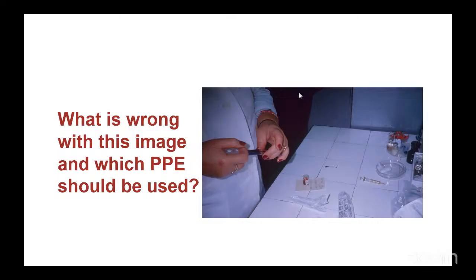Someone says no gloves. Use of hand gloves. Okay, is that all? Look at it very well. Can't you see all those things? The needle was not capped, yes.